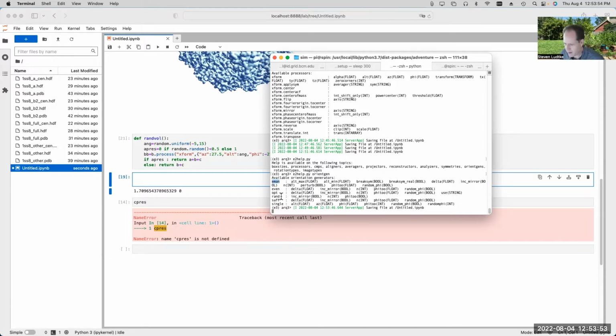Now you might say, why can't I just take the Euler angles and generate random values for all the Euler angles? Well, that won't actually give you a uniform distribution on the sphere. So you have to be really careful when you're trying to generate random orientations. There are a few strategies for doing it. One easy way would be to use, say, quaternions, generating a random quaternion vector and then a random rotation around that vector. I'm pretty sure that gives you a random set of orientations. Or you can take the risk out of it and use one of these existing things.